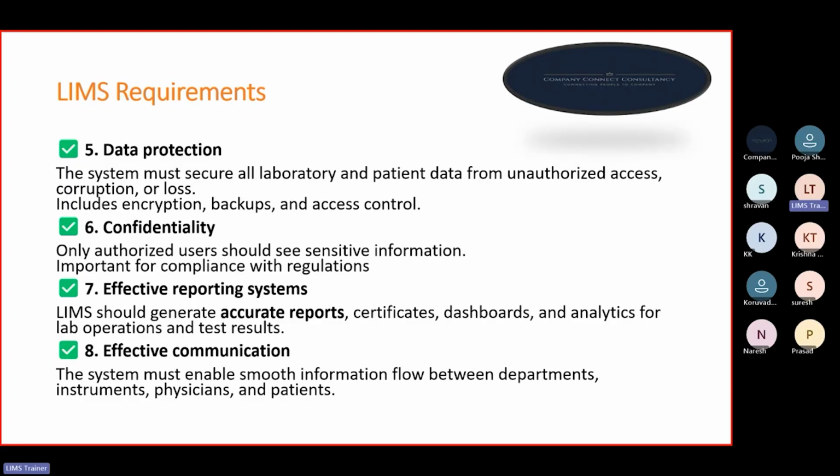Then the 10 analysts will do the analysis, record the results in the system, and send them to the reviewer in the system only. So that workflow also will be managed here.